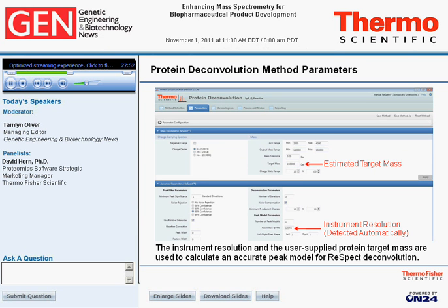One of the interesting tools we've given users is that RESPECT requires a peak model, and I think most, if not all, deconvolution algorithms require that. Instead of requiring the user to figure out what that is, we understand how peaks are shaped on our Orbitrap systems. So instead of a peak model, we ask the users to give an estimate of the target mass. It definitely does not have to be accurate within ppm level. It can be 10 or 20 kilodaltons off. But what that target mass does is it tells the software to calculate a peak model based on a protein of that mass at the resolution of the instrument that's shown down below. We are not asking the users to supply that resolution. That resolution is autofilled based on the raw data file. So the more accurate that peak model is, the more accurate results are going to be, and the more sensitive that result is going to be. Next slide, please.